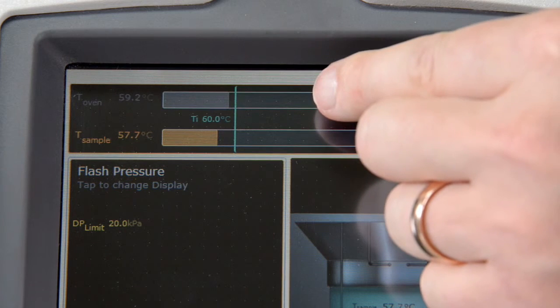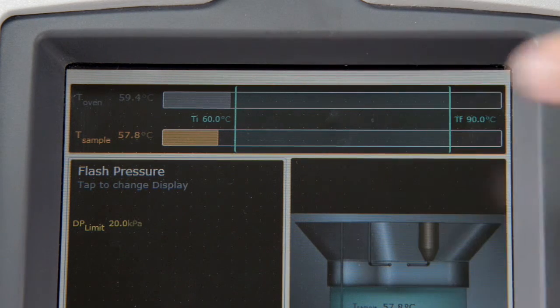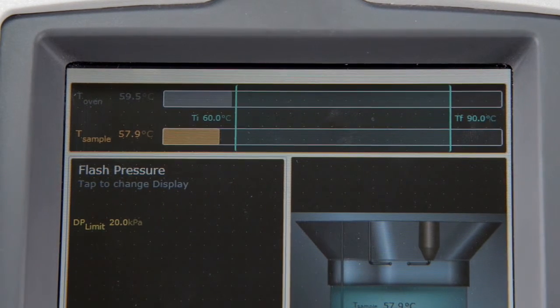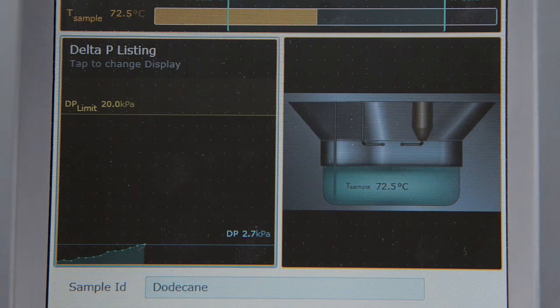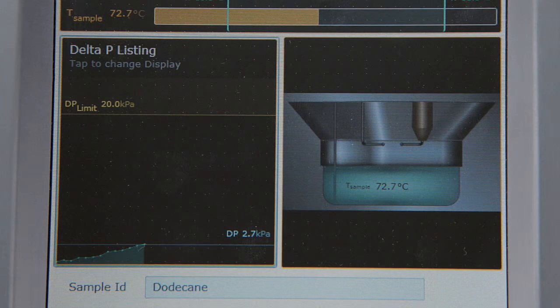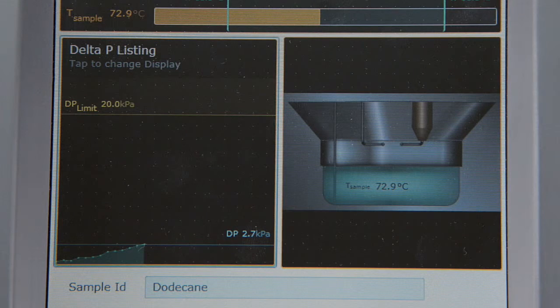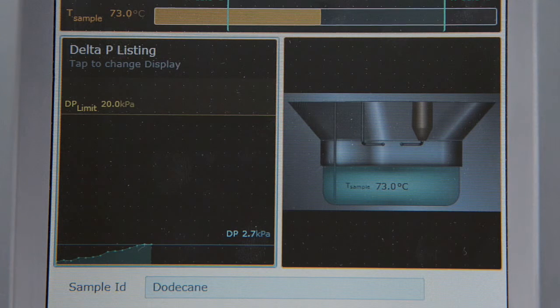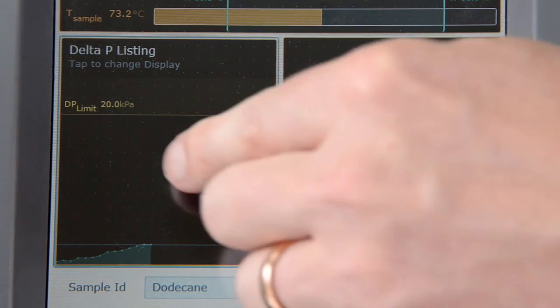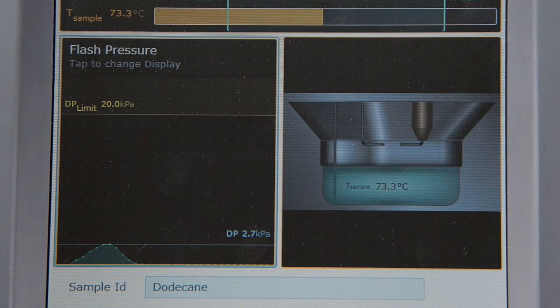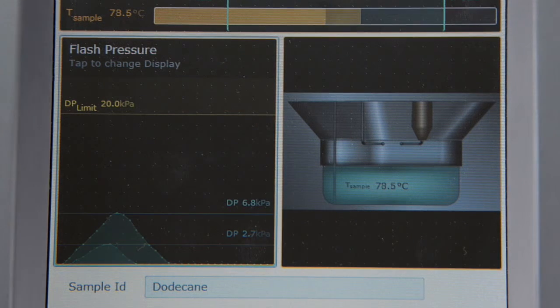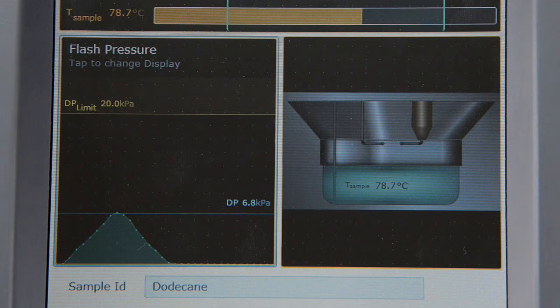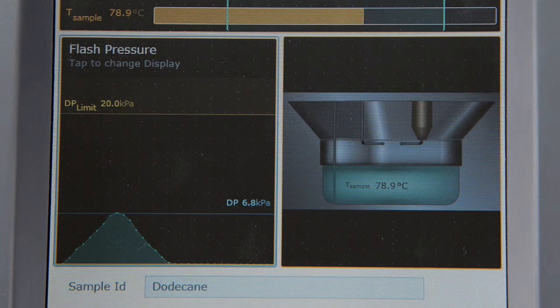Observe the temperature bars for oven and sample temperature on the top of the measurement screen. For each ignition, the flash pressure is monitored. To identify contamination in samples, you may switch between the pressure curve and the combustion analysis. When the flash point is reached, the flash pressure will be suddenly very high.